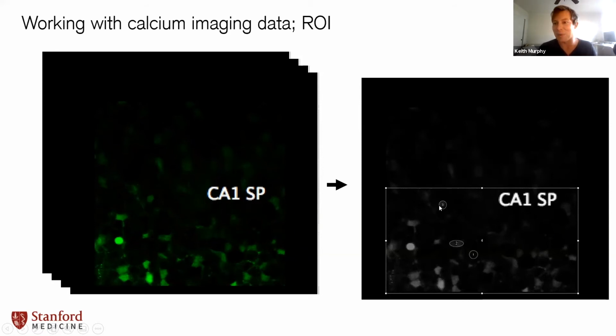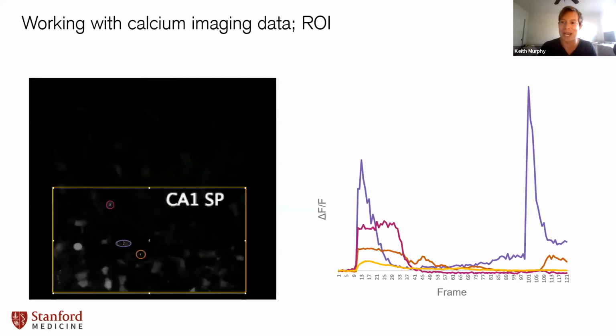And the question I wanted to ask as a scientist, and again, anyone can do this, very easy, is do all neurons have the same response profile to ultrasound stimulus? And I didn't even collect this data myself, to show you how everybody can go in and be a scientist. Here I've dubbed these cells 1, 2, and 3. They're color-coded here. And here you can clearly see at frame 9, when the ultrasound comes on, a large rise in all of these cells.